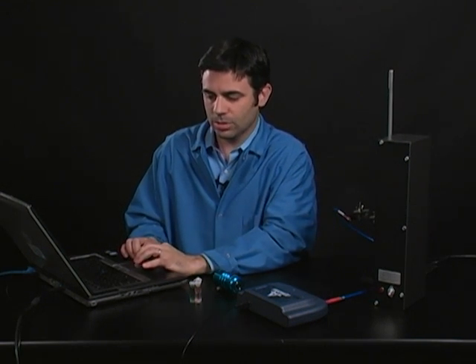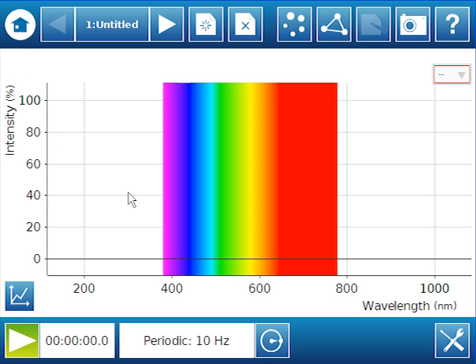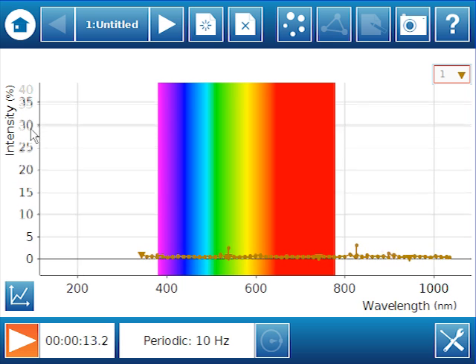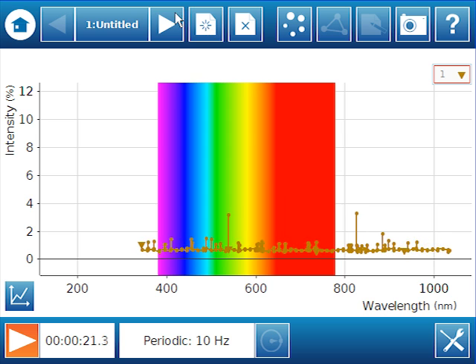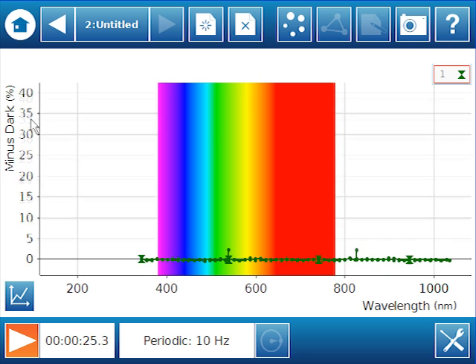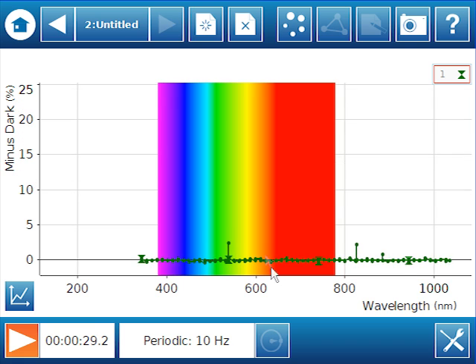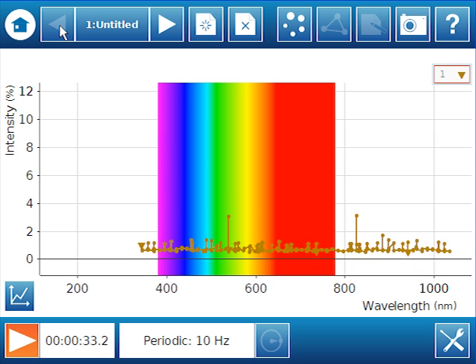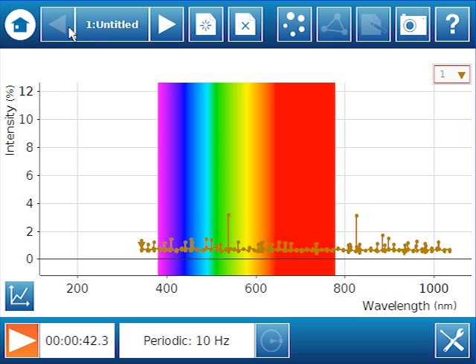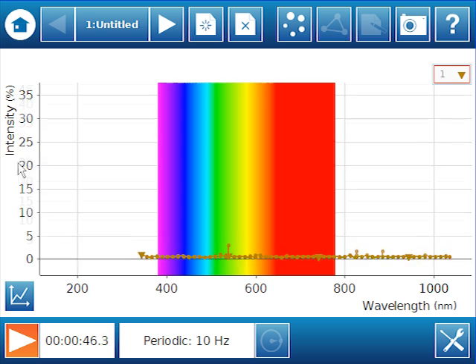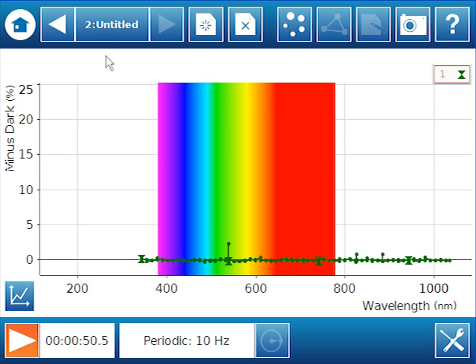So we're all set up. And I'm just going to hit start so we can see a key difference here. So here's my intensity versus wavelength. And it looks nice, zero intensity. And over here, also zero intensity for the minus dark. But if we look a little closer, and this is what the SparkView software allows us to do very easily, if we look a little closer, it's actually not quite zero. And it's picking up some specific lines. Whereas the minus dark, if we look a little closer, is much closer to zero. Still there is some noise in there, but it's not as obvious as it is over here. And that gets important depending on when we're looking at spectral lines. We want to try to just look at the spectral lines of the sample. So we're going to rescale this to an appropriate setting.